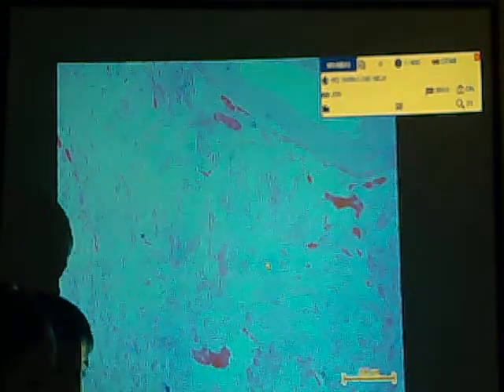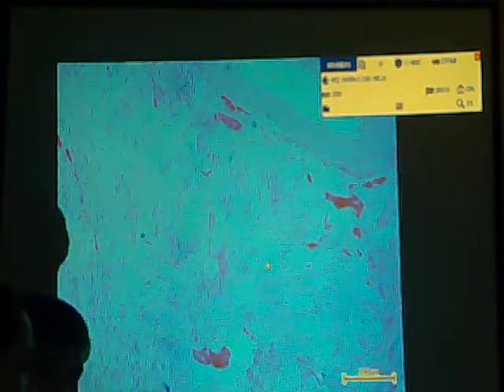Guess. Interactive daw ni Be. I don't want to be the one just talking here. I want you to participate so that it would be easier for you to remember if you participate. So what is this? And what is the special stain used to view the particular substance? Yun! So what is this?